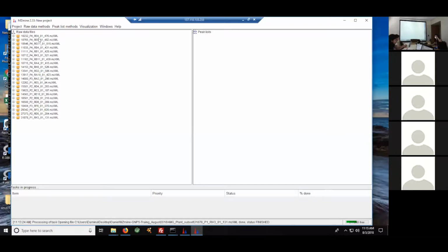You good? Awesome. The other thing is, basically, it says there's this one. Copy that again. Just drag. Exactly. So I just drag and drop these over here. What we should probably have is the camera closer. It seems like it should be significantly less.